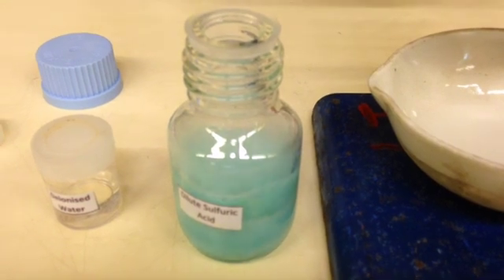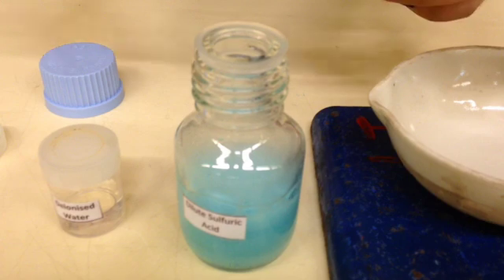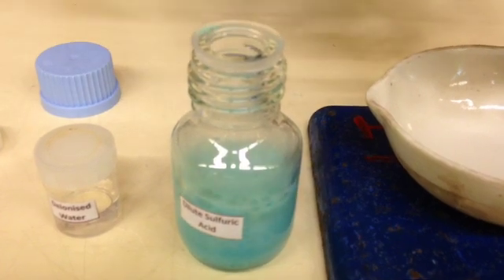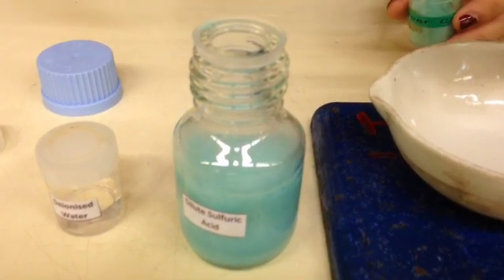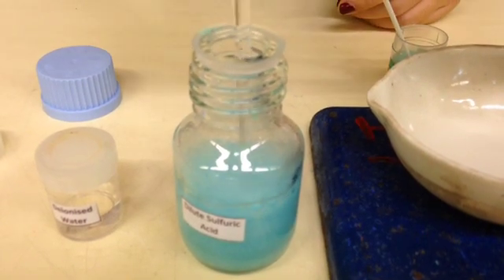So as I add more, you can see that the bubbles continue to come out. We call these bubbles effervescence. So the aim is actually to just keep adding the powder, as well as stirring it, until we don't see the effervescence anymore.